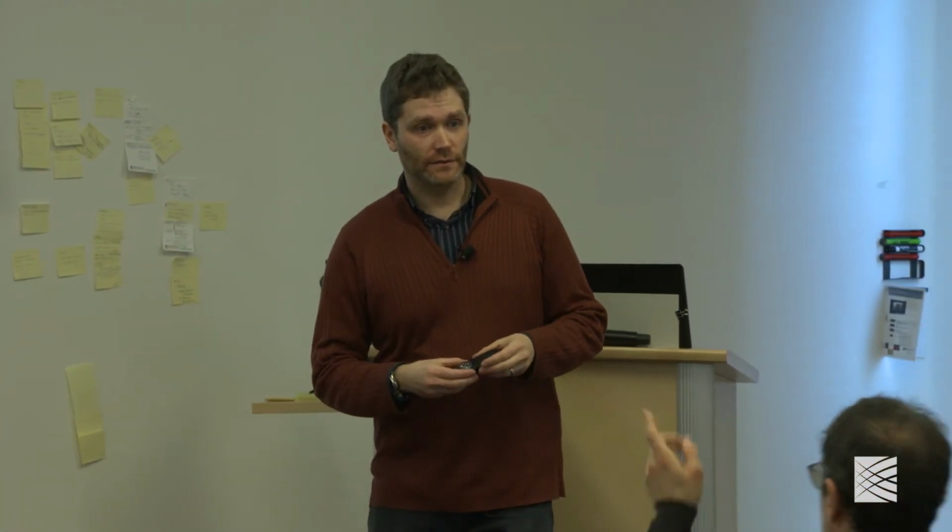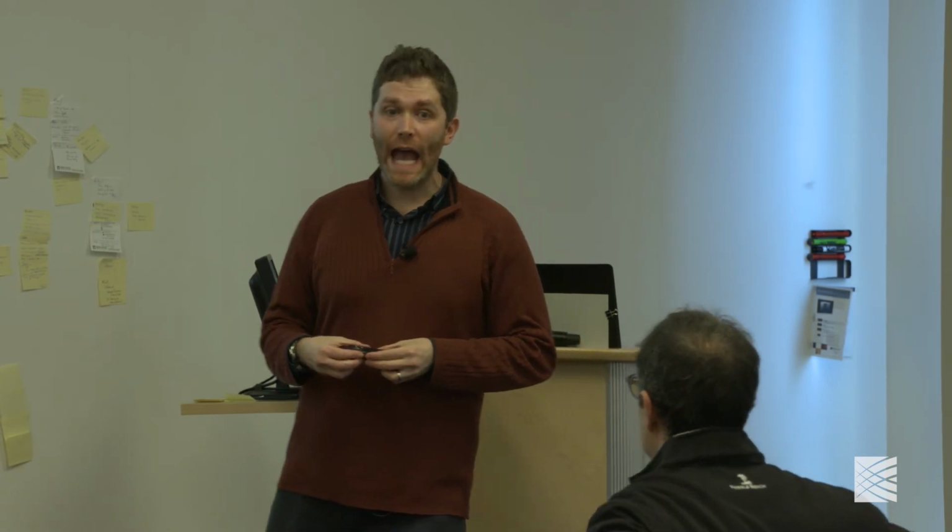Oh, wow, yeah. Can you use it also for targeted sequencing or only whole genome? Okay, the answer is yes. We don't have any evaluation data on it because every targeting is different. How many targets are you using? Pro tip for people out there: if you're using very few targets, you may want to just use the estimates without the segmentation, because if you have huge distances between the segments, they can get thrown off. That is not something we've corrected.